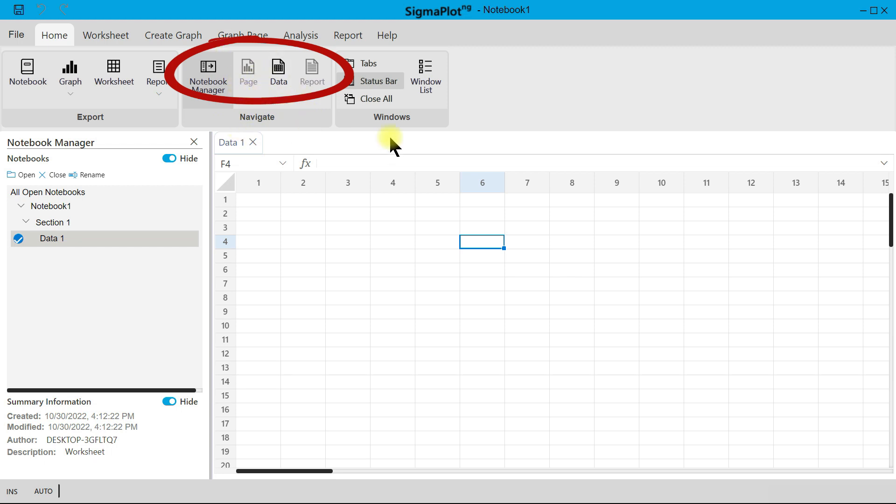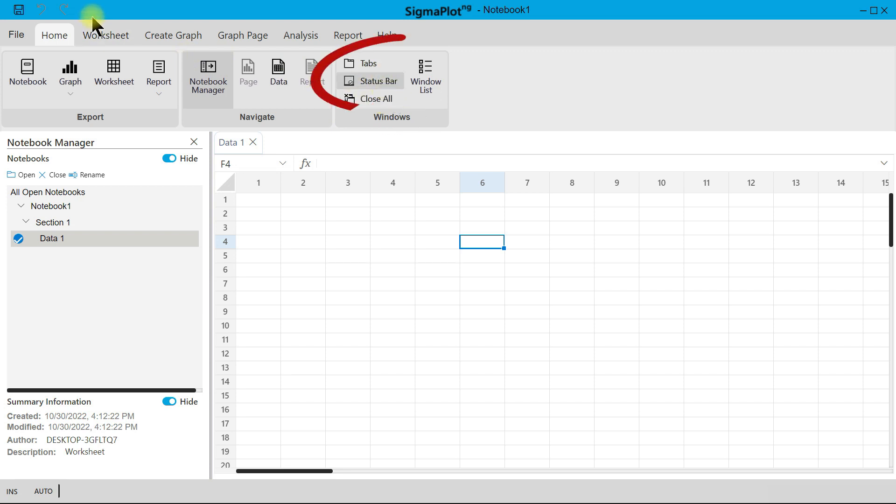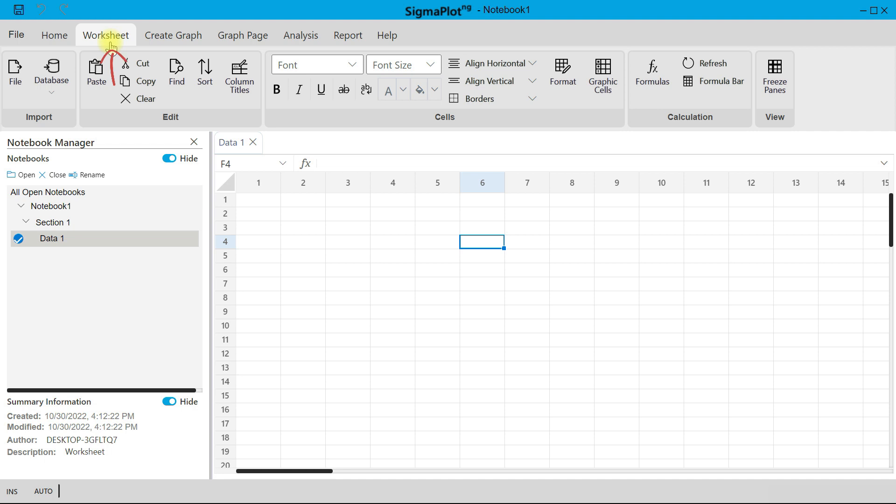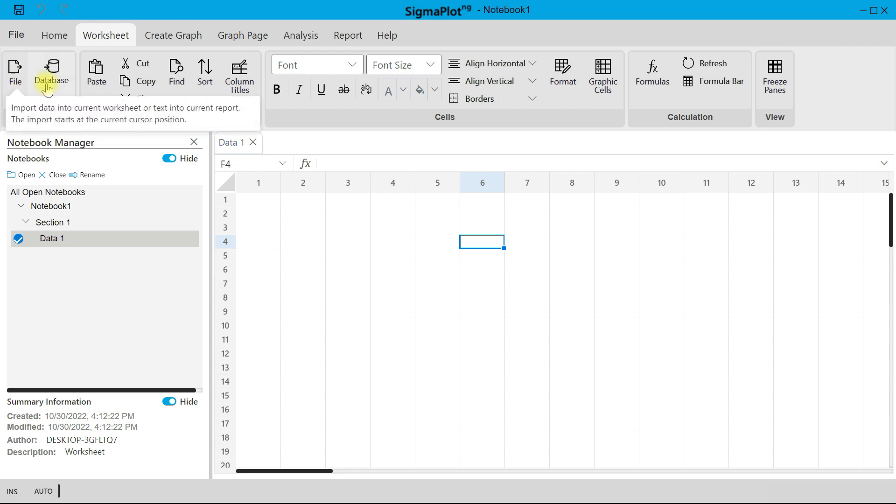And then you also have your Windows section and can always make any changes to this as well. There is also the Worksheet tab, and on the Worksheet, this is what controls the worksheet. You can import a file or a database into this worksheet area.